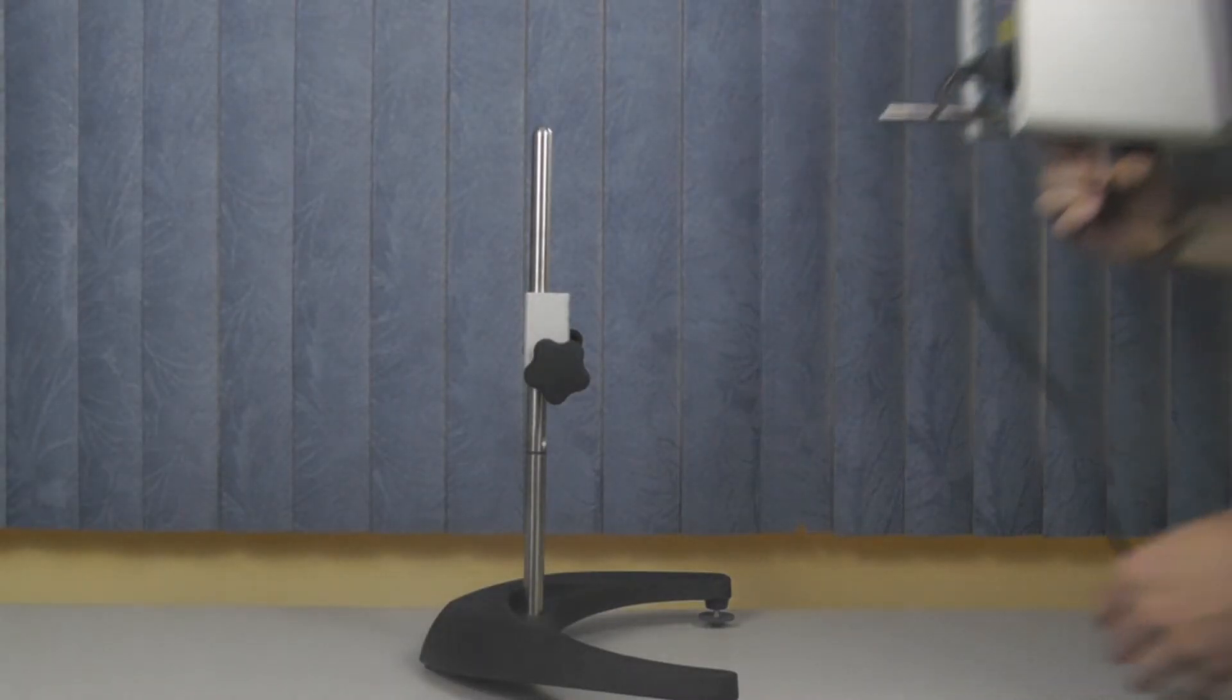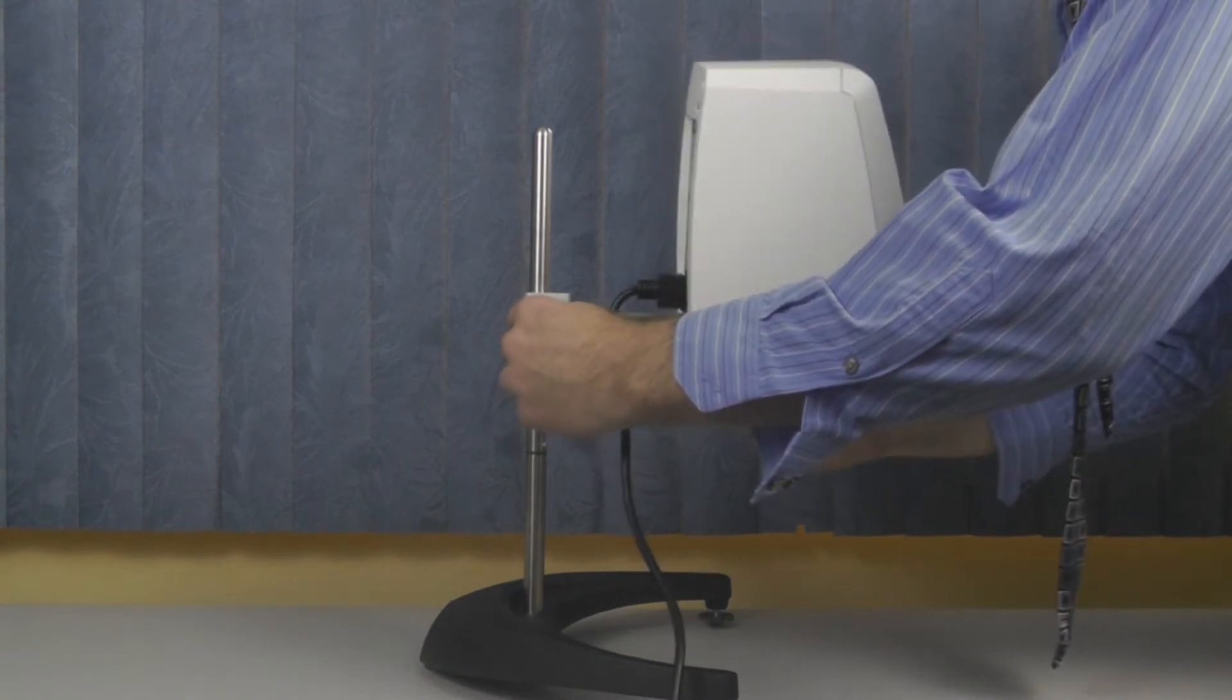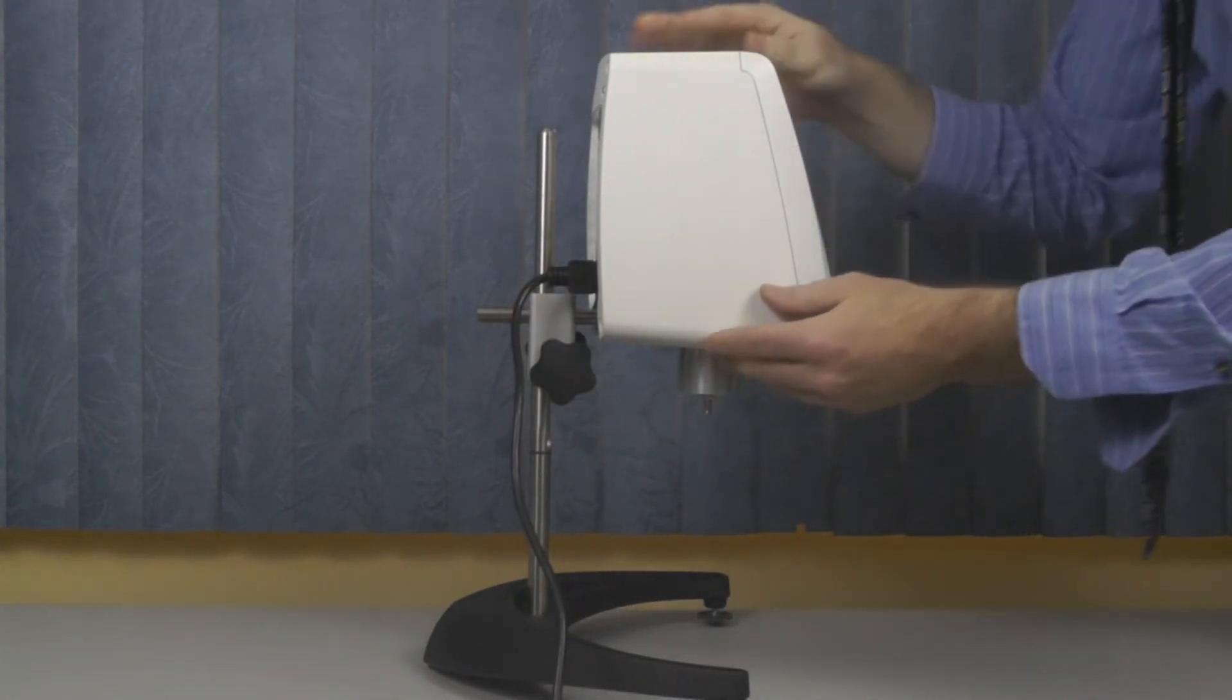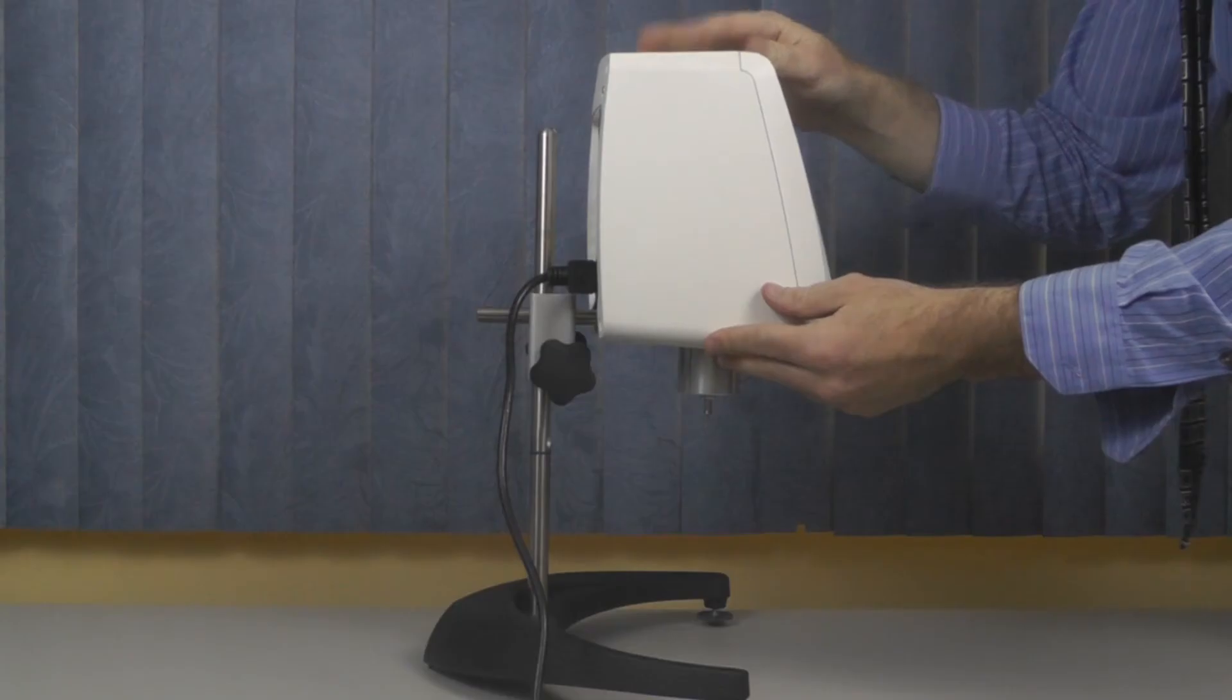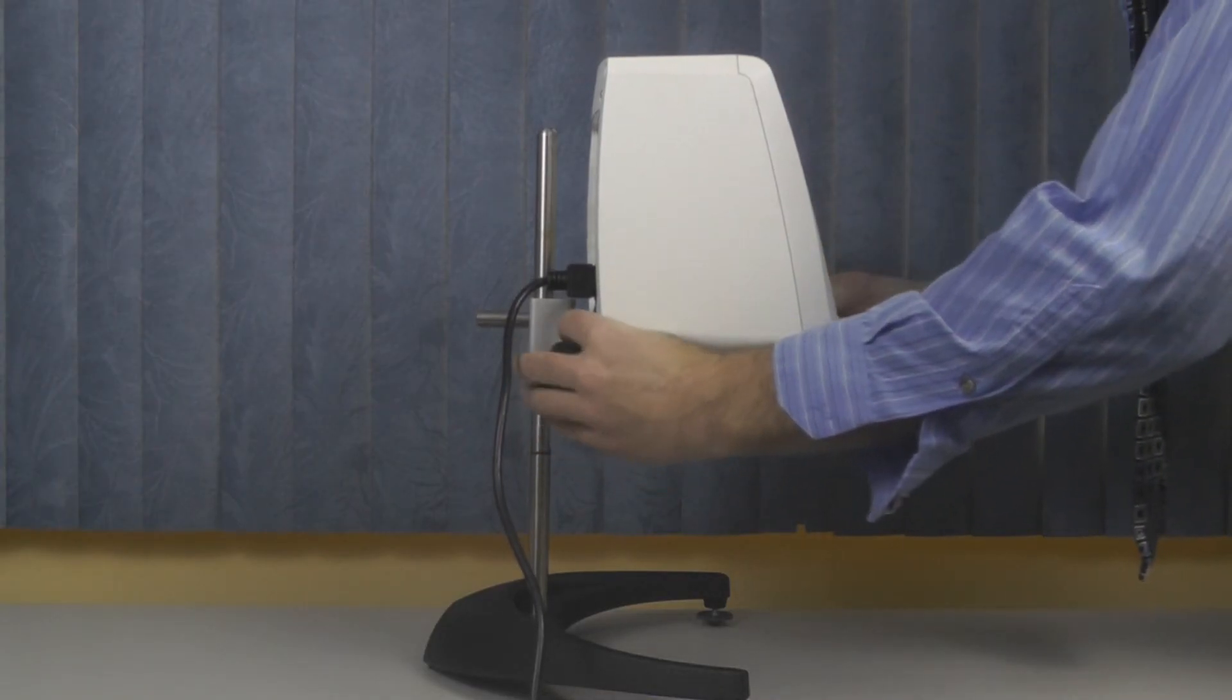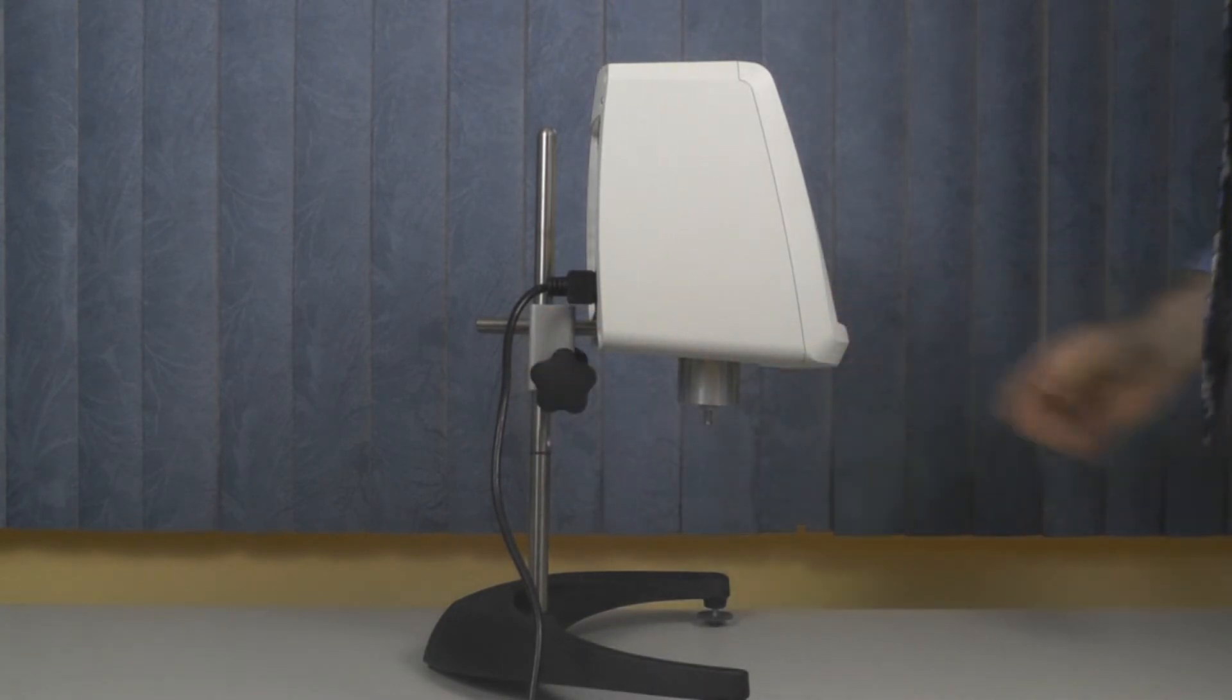You begin the leveling process when you first attach the viscometer to the universal clamp assembly. Once you insert the mounting rod into the clamp, you can change the angle of the instrument so the bubble in the bubble level is close to the black circle. Once it is close, tighten the clamp assembly so the instrument is in a fixed position.